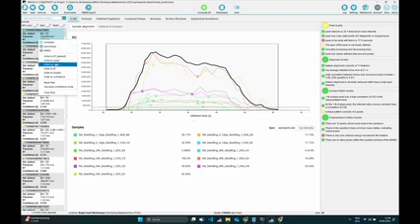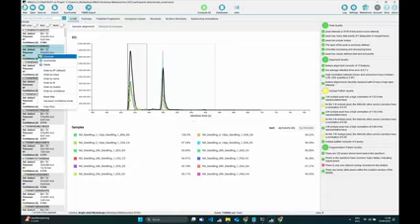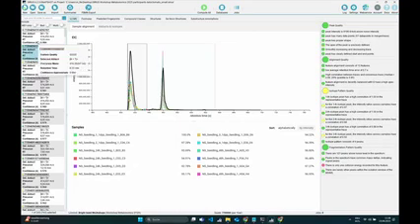So if you right-click, you will get this context menu with some settings. So for example, you can order this list by retention time, which is the default, or you can order it by mass. But what you can also do now, if you imported everything, if you loaded the project space, you can also order it by confidence. So we now just right-clicked and then selected order by confidence. And now we have the features with the most confident annotations at the top.